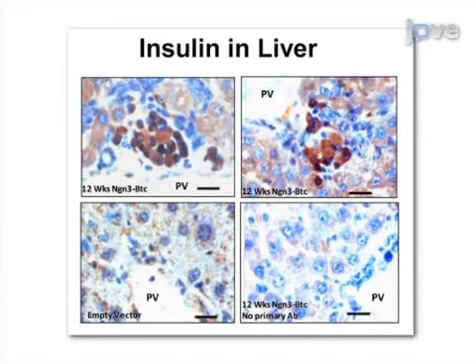Results from these assays demonstrate that hyperglycemia is reversed in vector-treated mice as a result of neo-islet formation in the periportal regions of the liver.